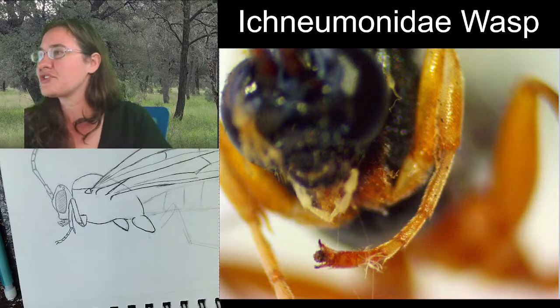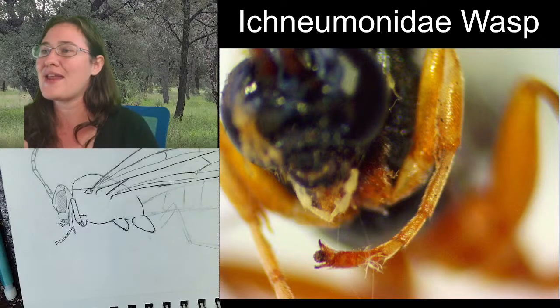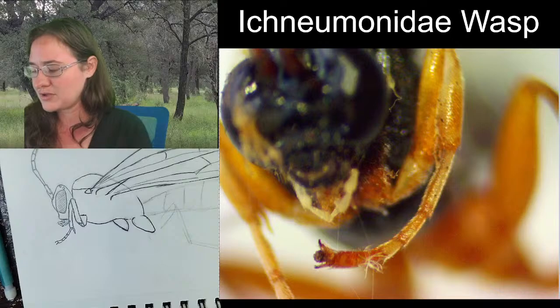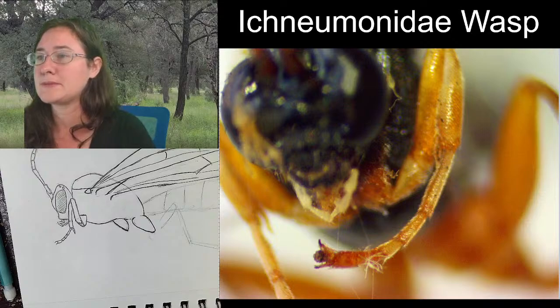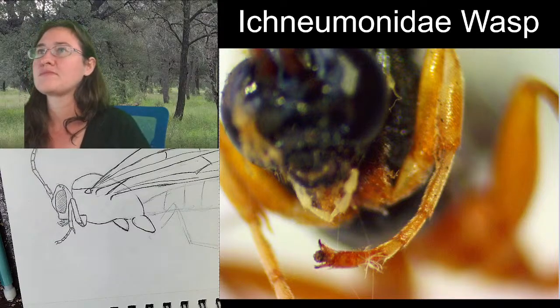Are there two tarsal claws and a pad? Yes. There is a pad in between the two tarsal claws, and I believe that that pad has a name. I believe it's called the pulvilli, unless that's the name for the hair in between a fly's tarsal claws. Let me look it up. I believe it's called the pulvilli. Spelled like this.